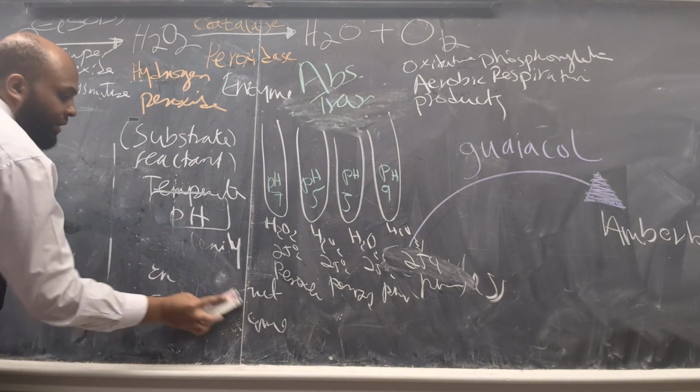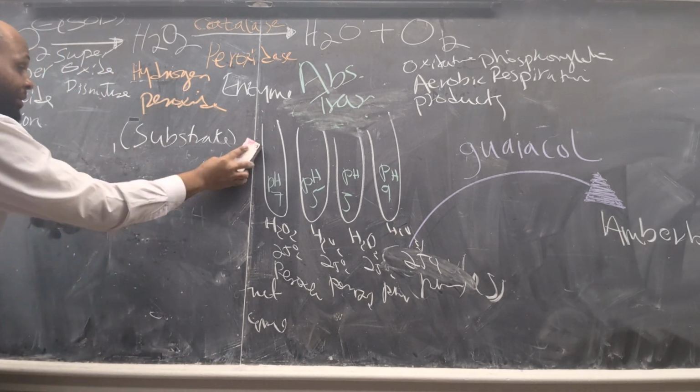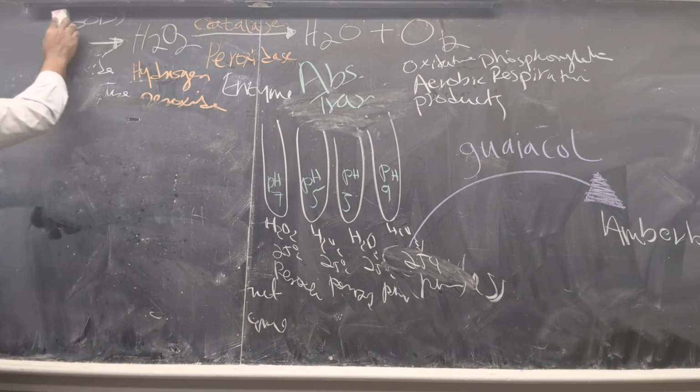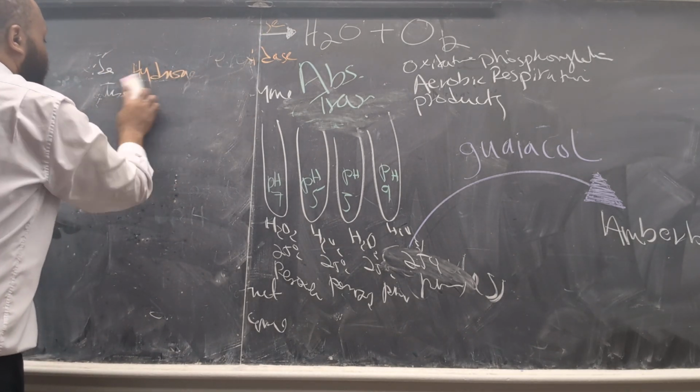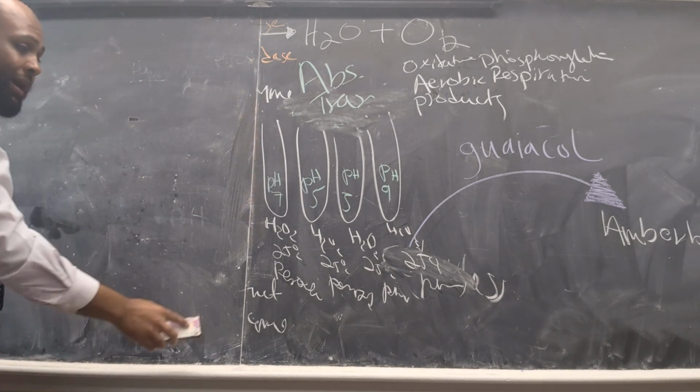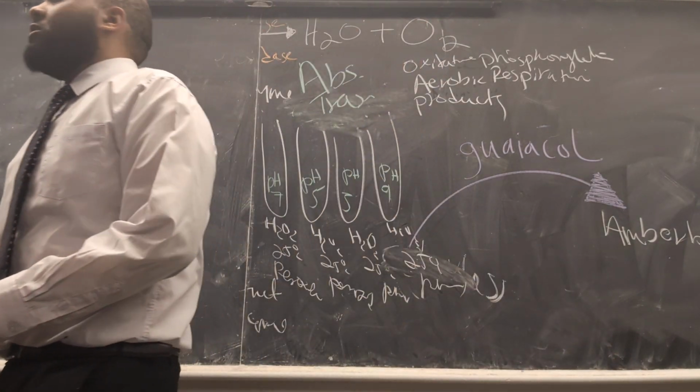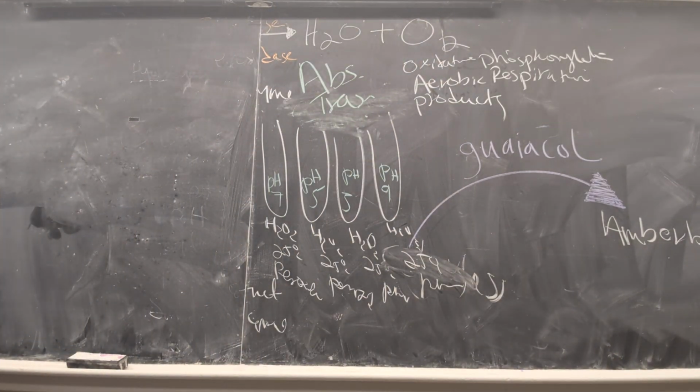You need to know how the spectrophotometer works. I'm going to ask you about that on the exam. So you have to pay attention now and understand really well how it works, because it's very important. You're in biolab, you don't know how the spectrophotometer works. How does the spectrophotometer work? So let's begin step by step.